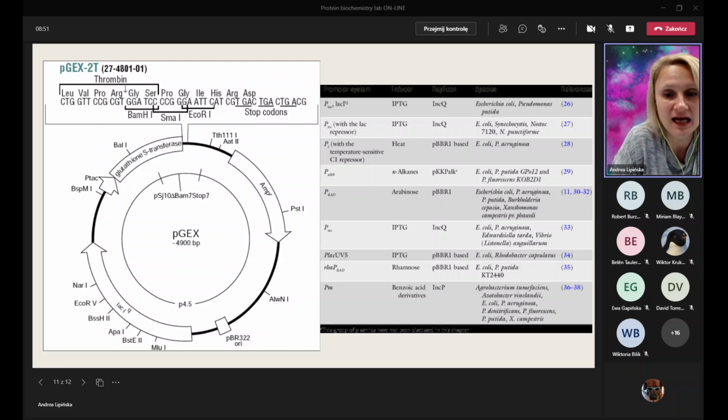Generally, that's it. So when we want to use affinity chromatography, for example, when we are purifying antibodies using protein G, Sepharose, or antibody-conjugated resins, or when you want to use antibodies to fish out your protein, then the structure is very important, and you cannot denature your protein, for example, with guanidine salts, because usually guanidine salts are used to denature your protein.